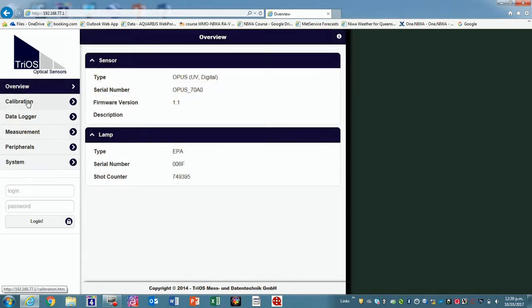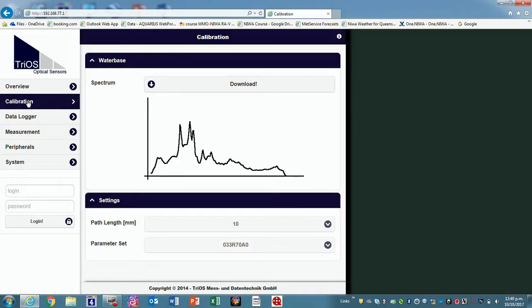So if I get calibration, it comes up with a curve. But you wouldn't do anything with that right now. Is that where we downloaded it? No, because you can't really tell much. That shape of curve is so specific to the spectrophotometer, the lenses, the whole setup, so it doesn't mean anything. If you want to go on data logger, you can.